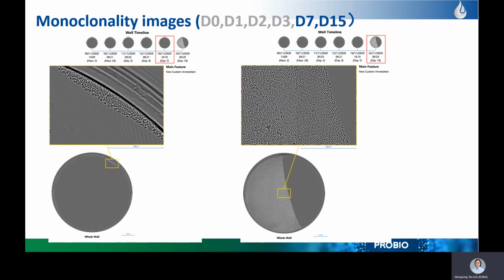These are pictures of the cells on the 7th and 15th days after plating. If there are 2 cells on the day of plating, the well will not be selected, or if in the following days the number of cells leads to misunderstanding, for example, if the number of divisions is not regular, it will be excluded.